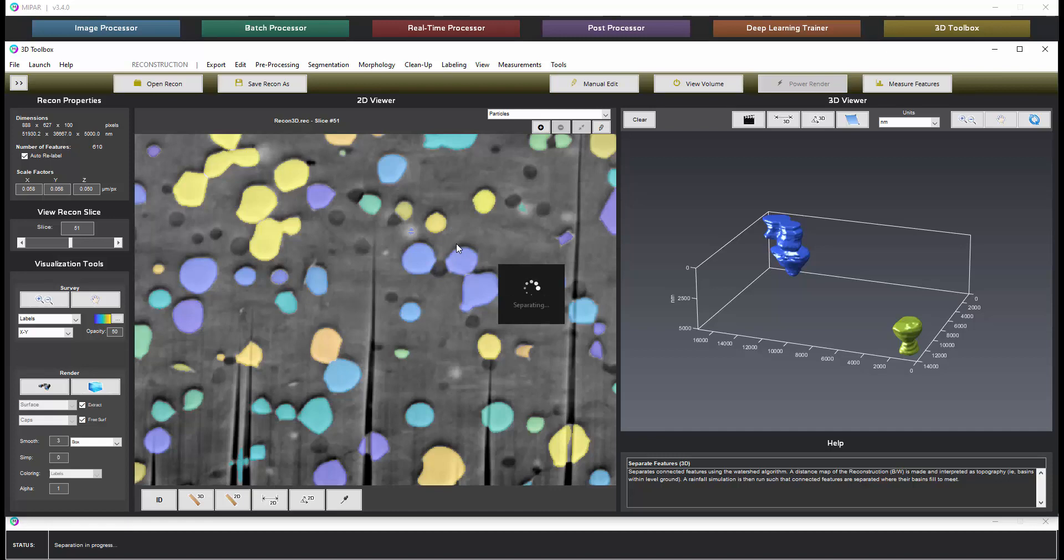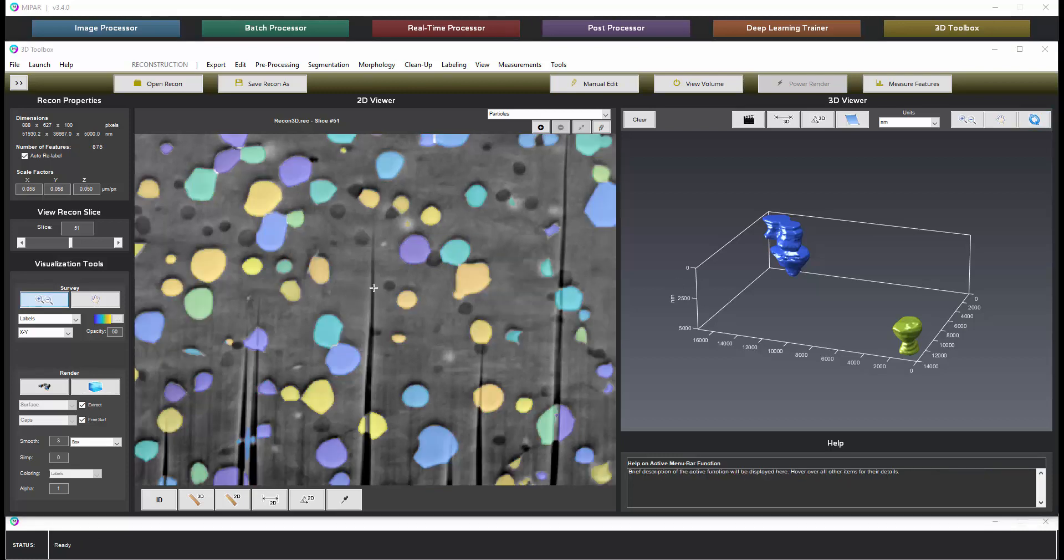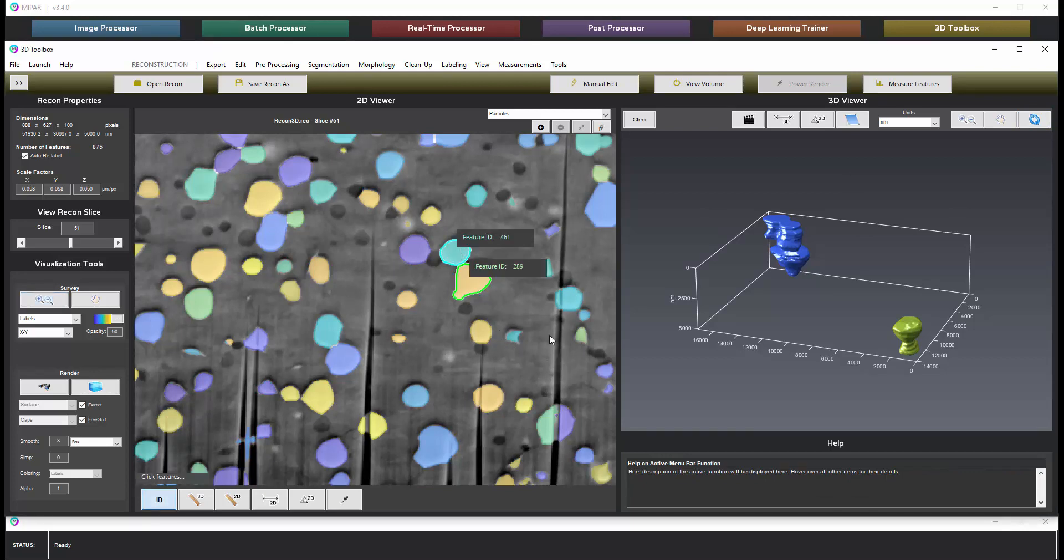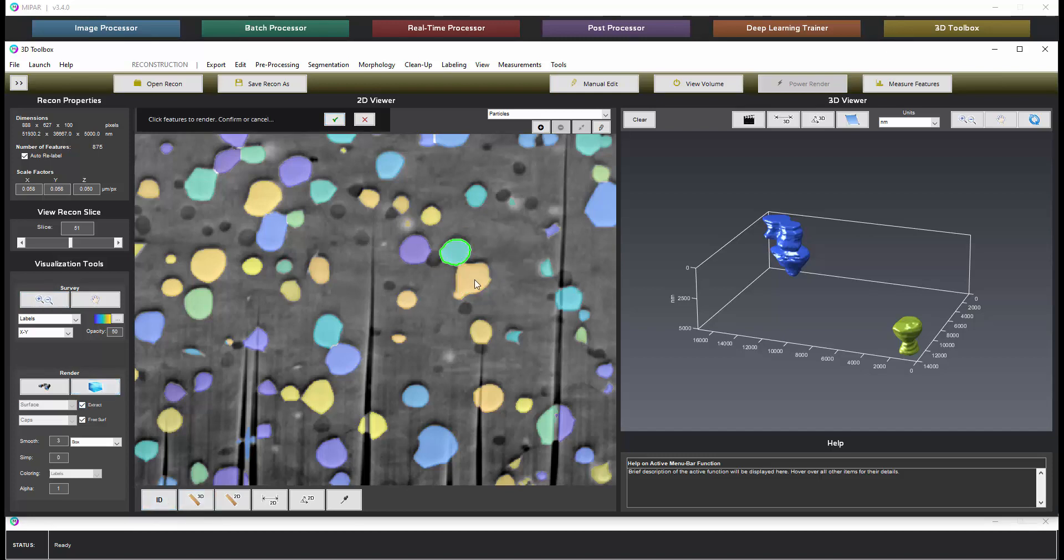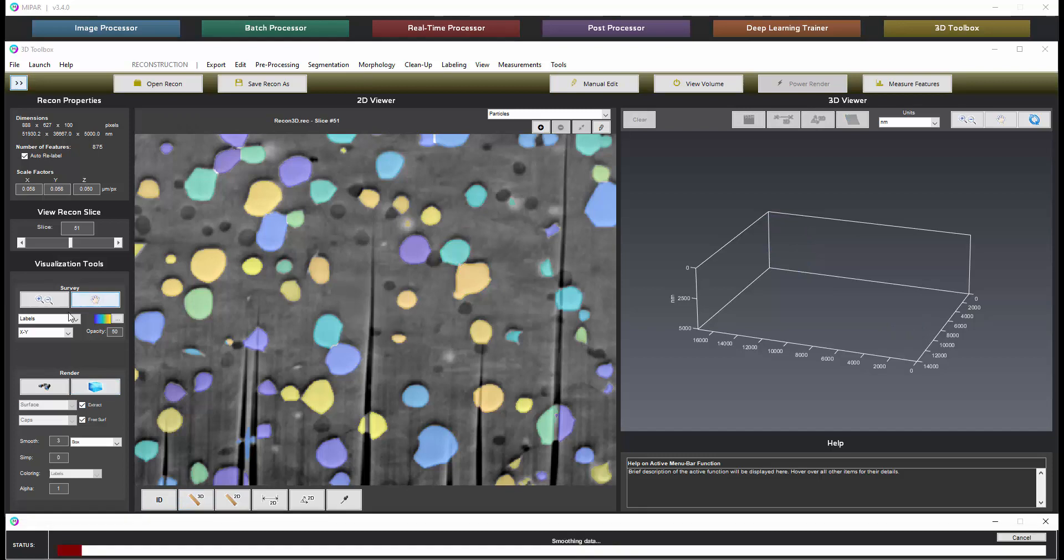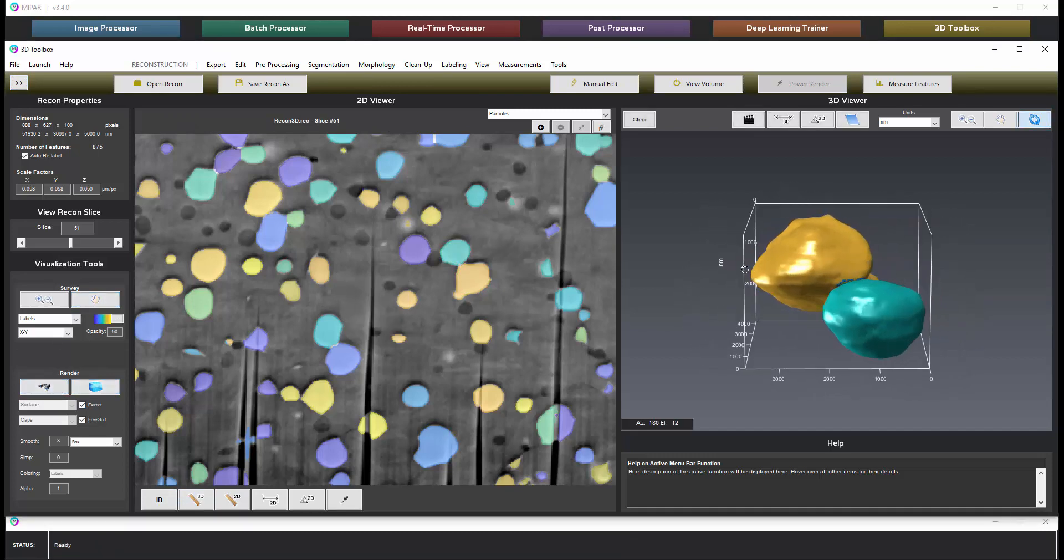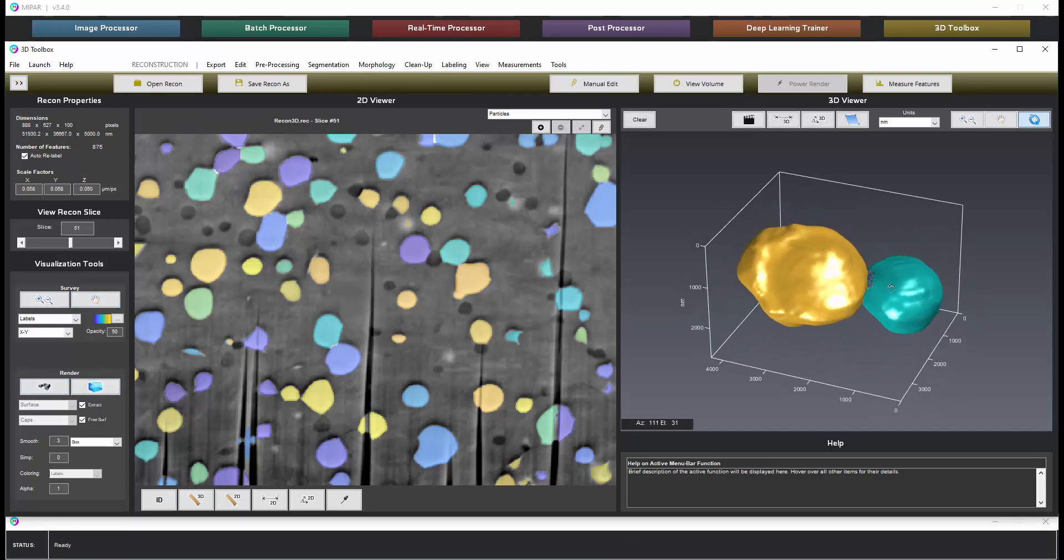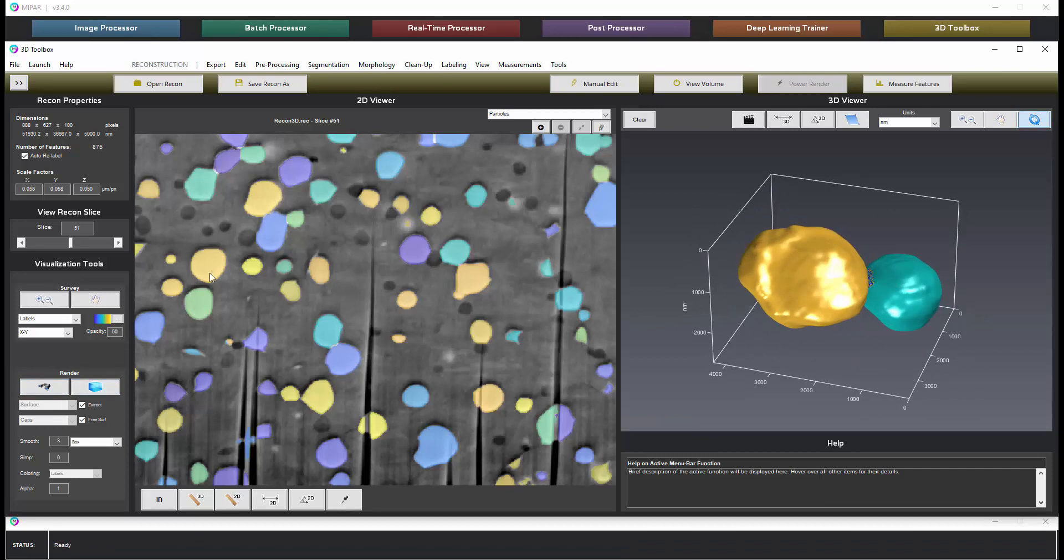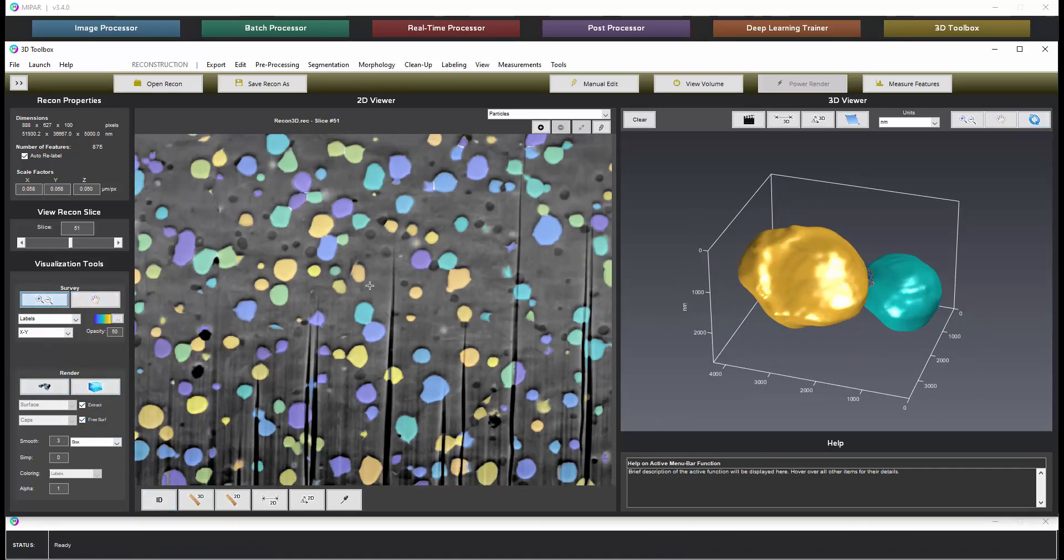This may take a little bit of time depending on the size of your data set and the performance capability of your PC. When it's finished now you'll notice we do have a full separation of the features. So we could visualize just these two.